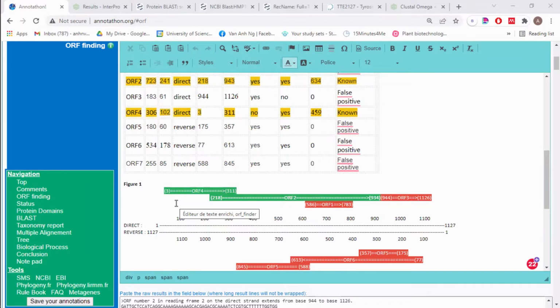If they belong to the same operon, they can overlap sometimes, you can have a lot between the end of your first gene and the start of the next genes. So I should put here known, but since we are not sure, we can add maybe putative known. You see what I mean? So you can put putative known because we are not sure.